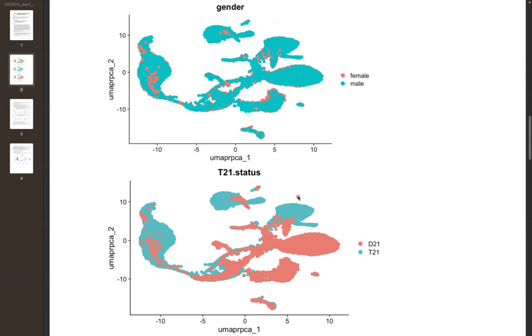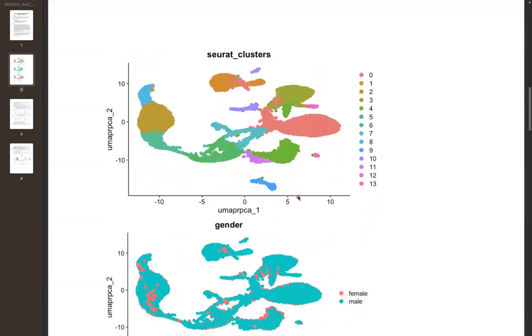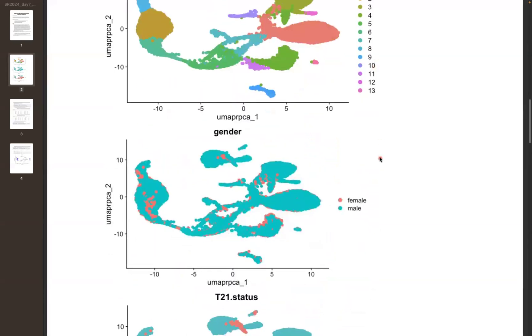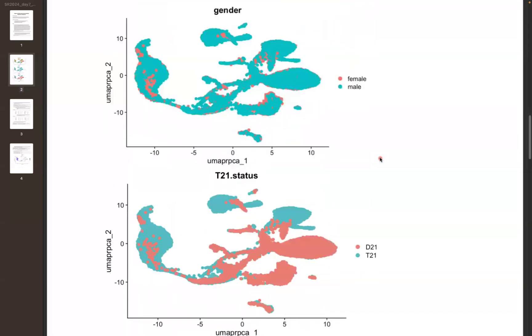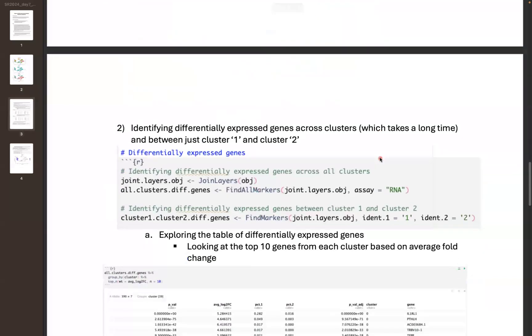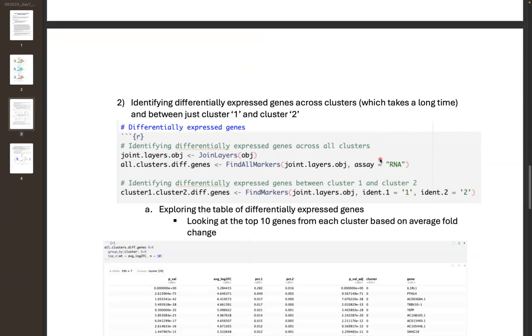Once we're satisfied with our parameters and cluster numbers — confident they accurately represent expected cell types — we actually want to go and identify those cell types. A lot of people think this is done automatically in single cell analysis. There are ways of doing this, and we'll go through it in a separate video. But from my experience, the algorithms that are supposed to identify cell types automatically don't work as well as you'd hope, and it really depends on the tissue and experiment. Whenever I've had to find cell types, I've had to do so manually.